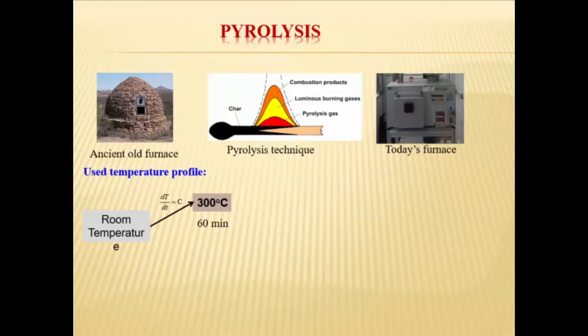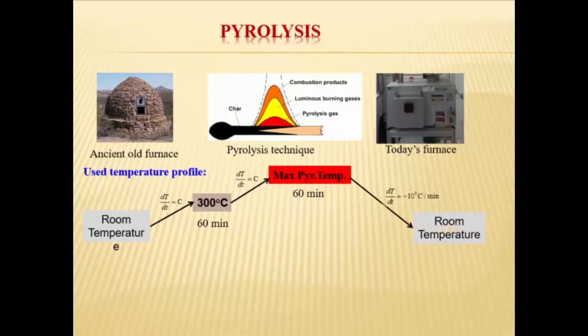Now what is pyrolysis? It is nothing but the breaking of bonds at high temperature where you are not supplying any oxygen. If there is no oxygen, the chemical bonds will be broken and you can get carbon-carbon bonds, because we are using a polymer structure. There will be hydrogen, nitrogen, oxygen and several other molecules with the carbon chain in the polymer, SU8. So we can break all the bonds, or most of them, not all. A few oxygen will still be there, and we can get a carbon-carbon structure at the final stage.